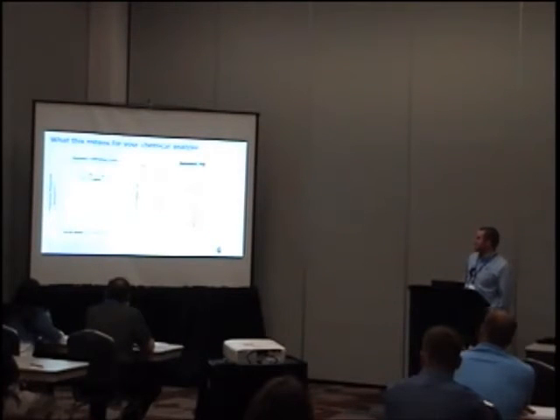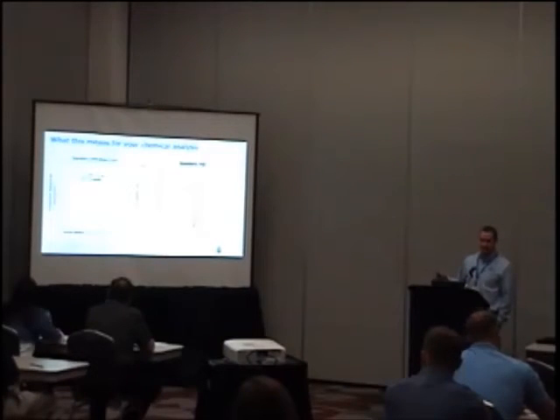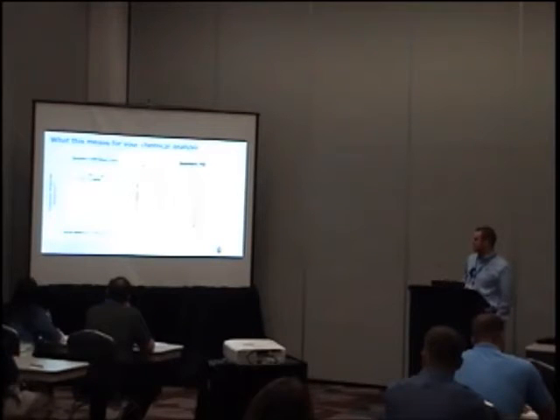In this case, here I'm taking the response of aniline, or the third component, relative to some internal standard ethanol, area per mole of carbon, and I'm looking at the response here. So in this case, this means that aniline has 1.45 times greater response in an FID because the carbon compounds in aniline have a greater response than ethanol. Ethanol has less propensity to form those carbon cations in the flame ionization detector. We also see a non-zero intercept, which indicates that there's some error in this sample, which could be due to when I was actually making it, and there was some vaporization happening when we were adding these different concentrations.